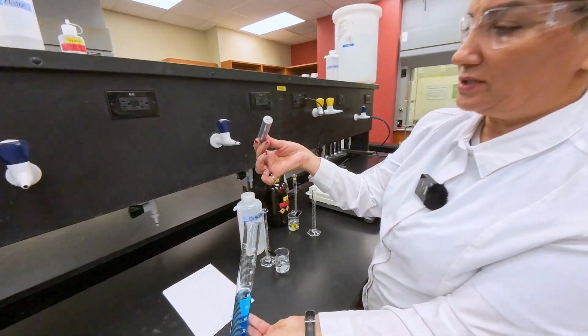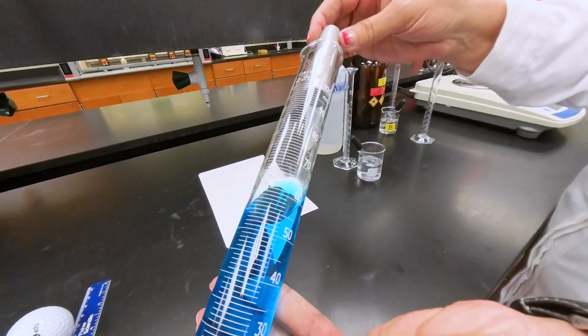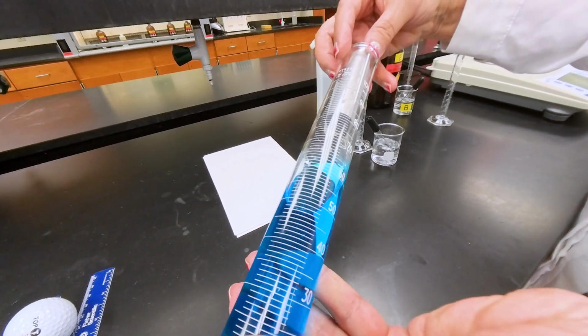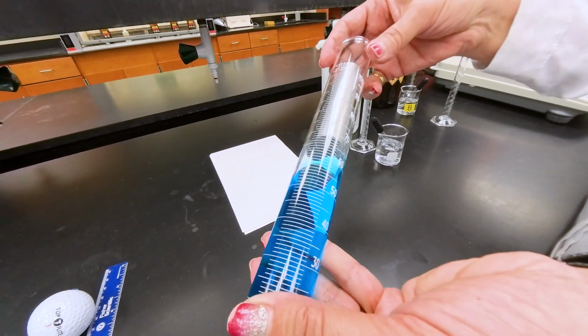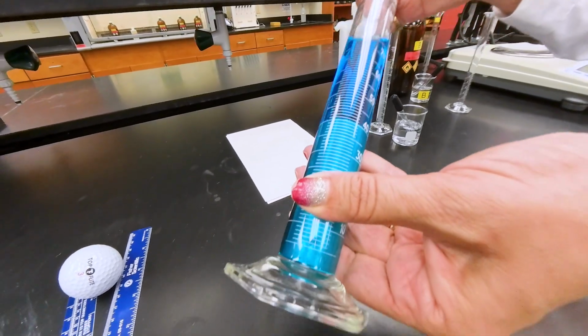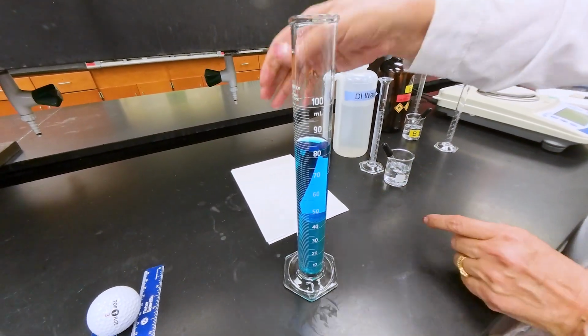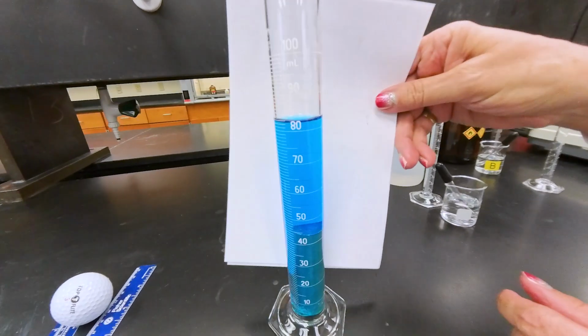Then you are going to slide the piece of metal down the graduated cylinder carefully. I tilt it this way and I go slowly because I don't want the water to splash. And what happens here, the solid is going to displace the liquid and the volume of the liquid increases.